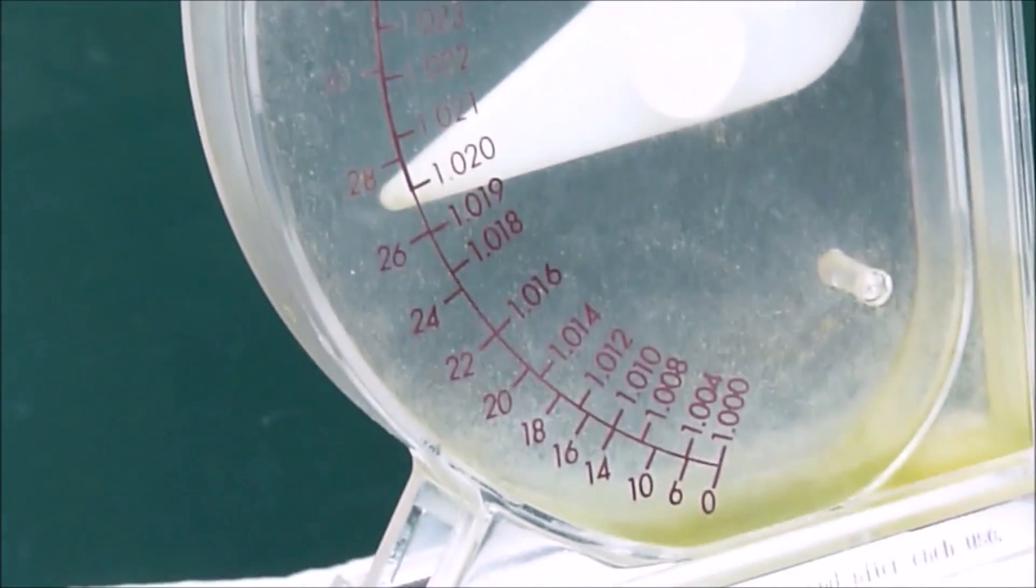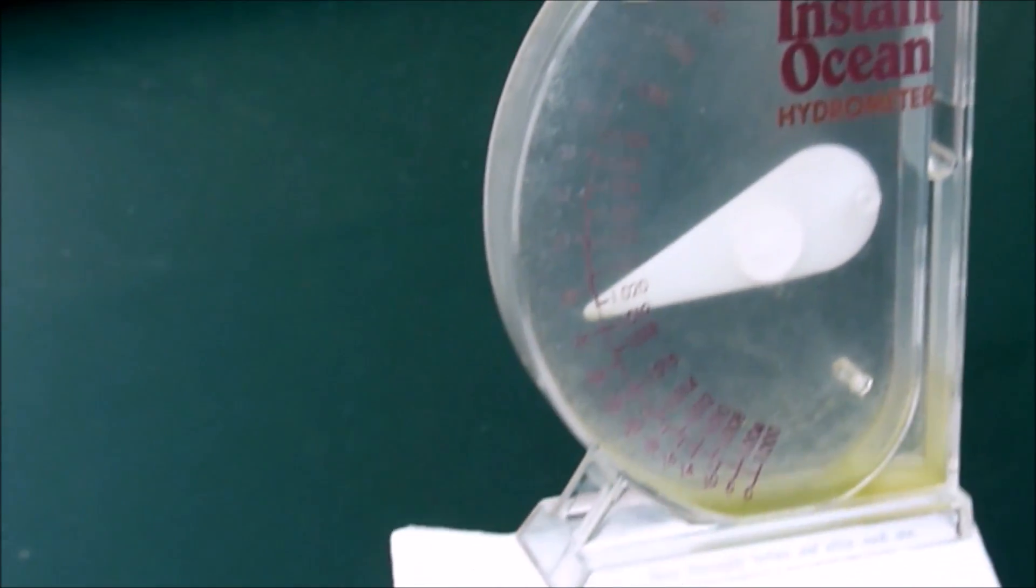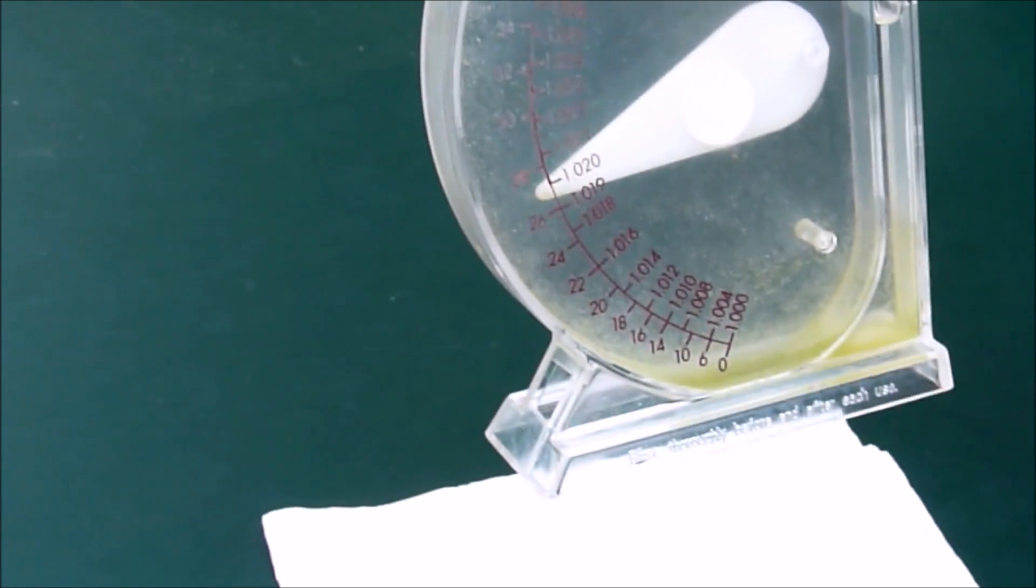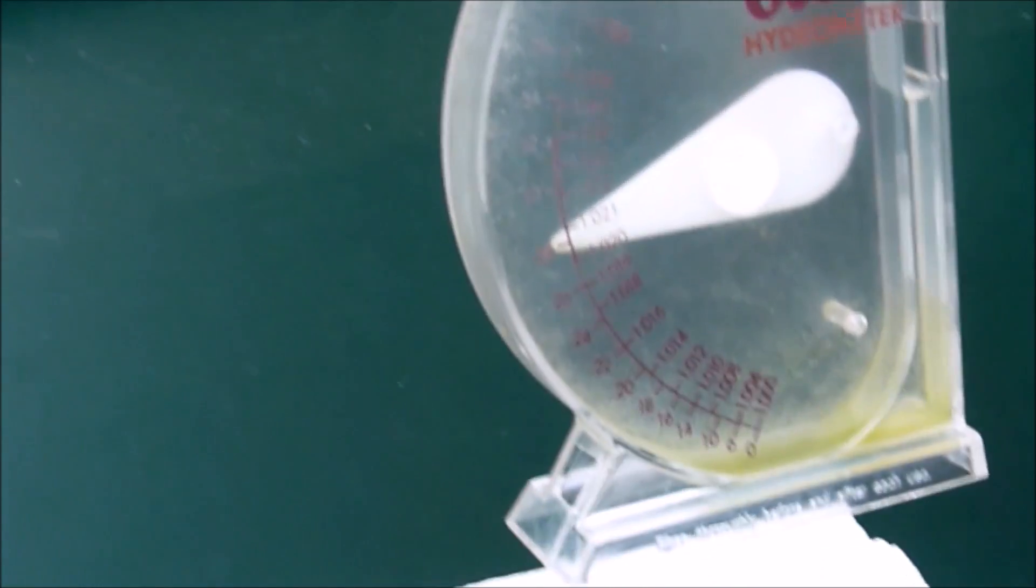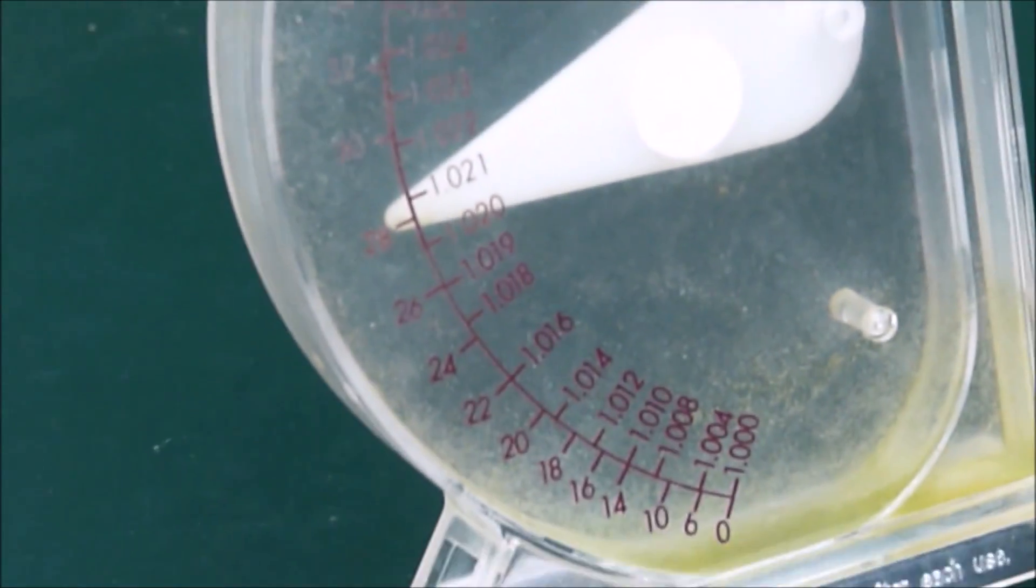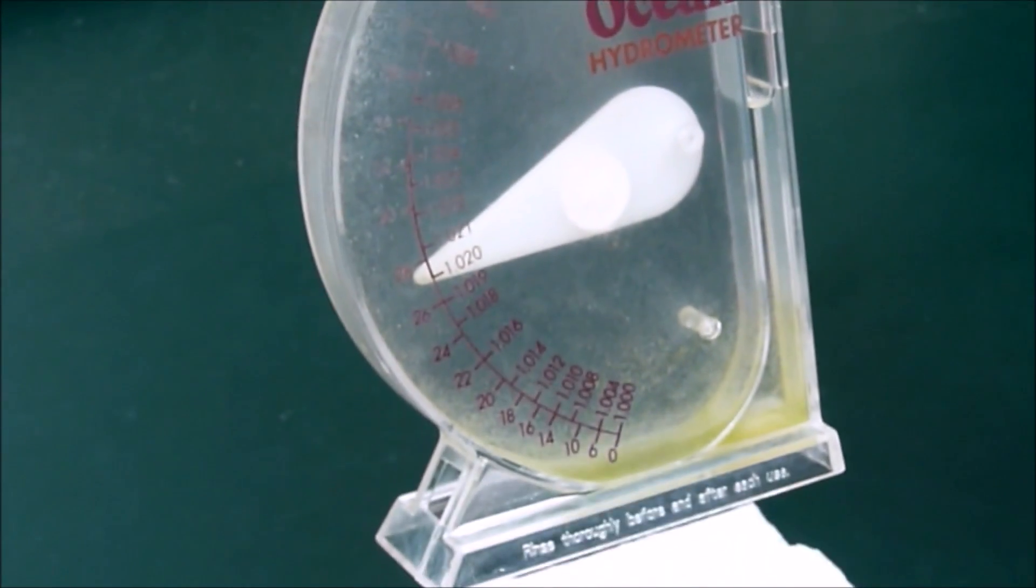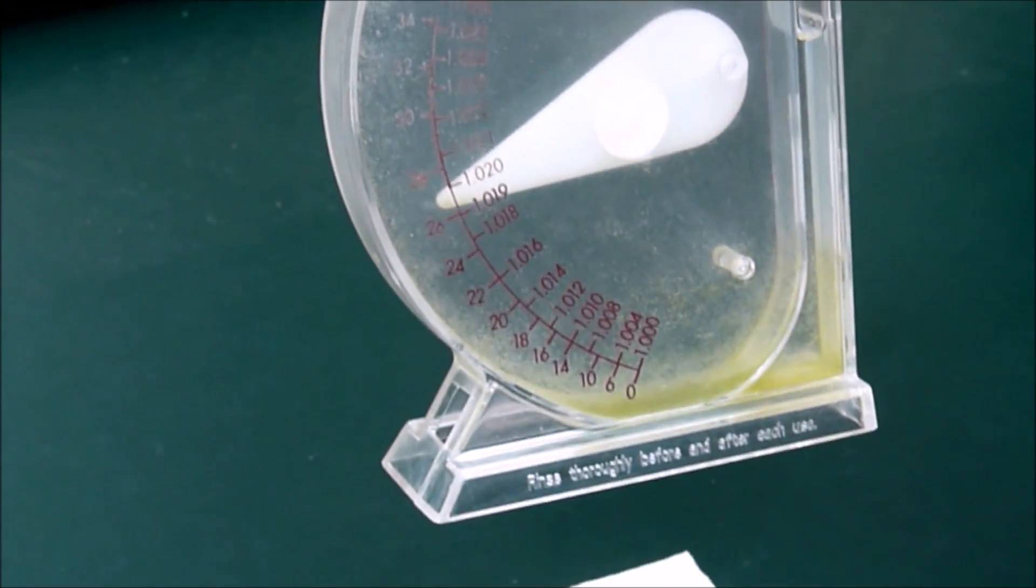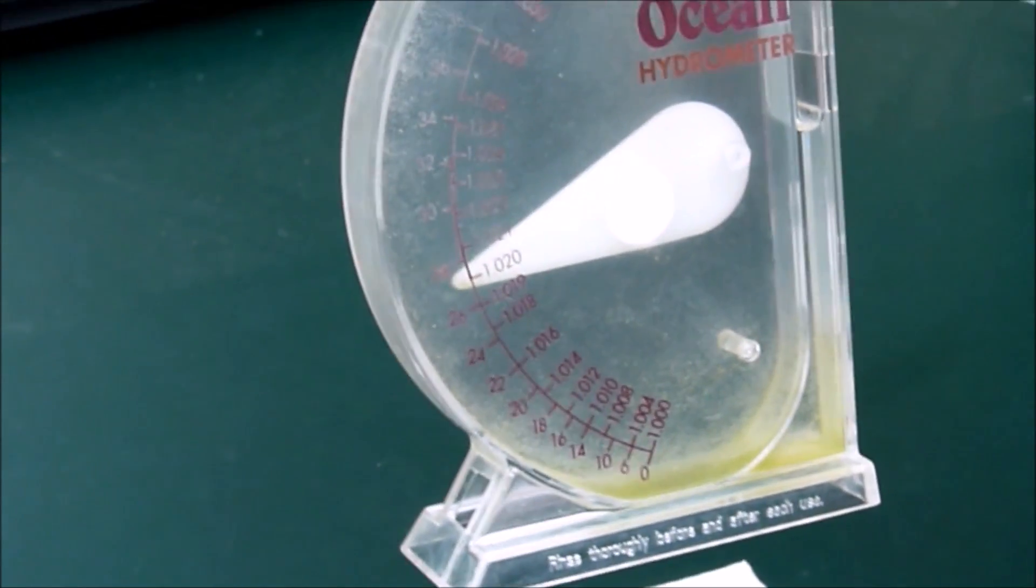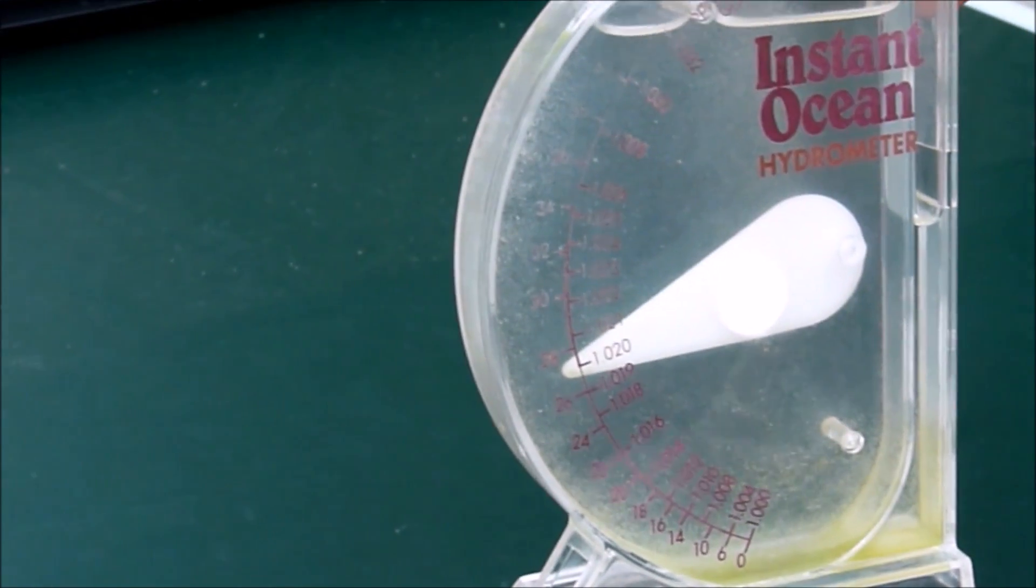So let's look at the pros and cons of this. The pros are, it's extremely fast. You just dip this in, get the water in this plastic area here, and then you have your parts per thousand scale on the outside, and you have the specific gravity on the inside of the measuring scale. And this mechanical arm just swings and goes to your number. Very easy to use, very simple. It's also very inexpensive. I think you can find these for less than $10.